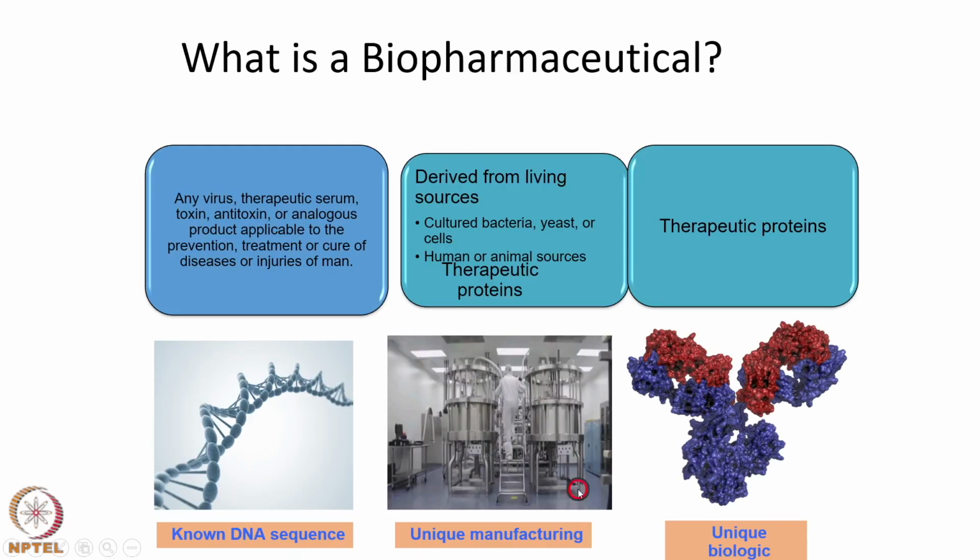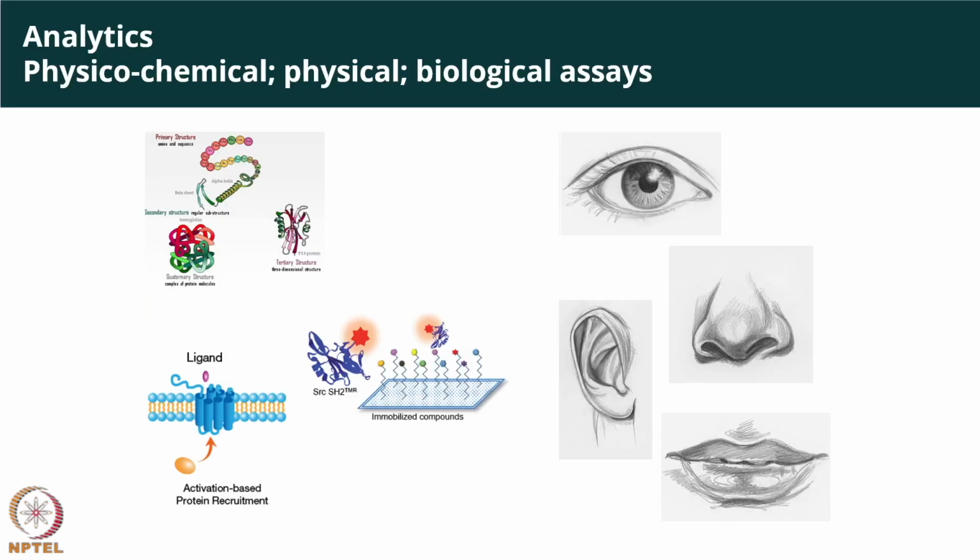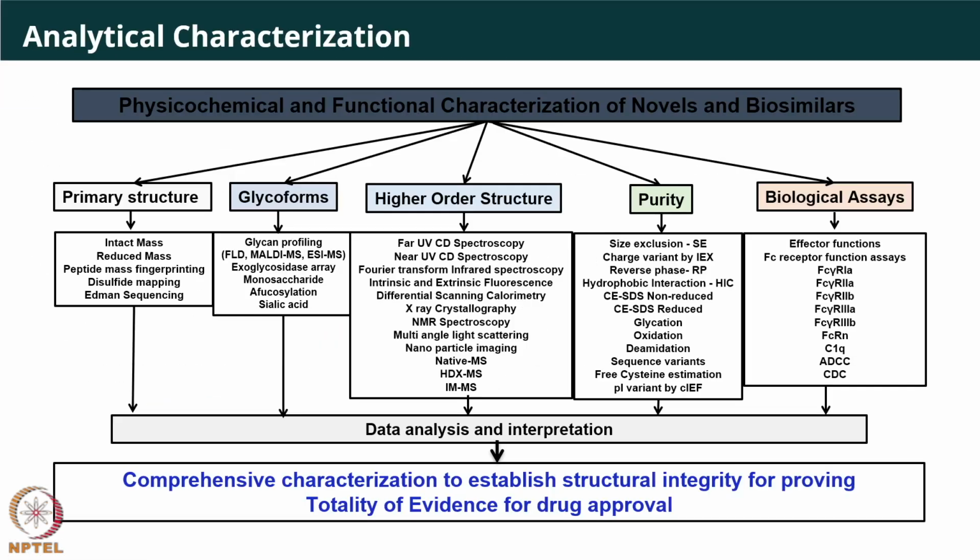After the production, we did the purification of that protein using various columns, and then we could detect that something is changing in this case, and if it is changing here, it is going to impact here.